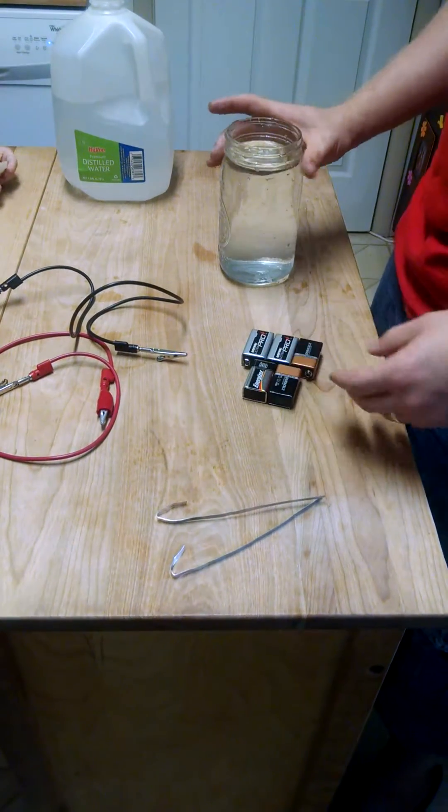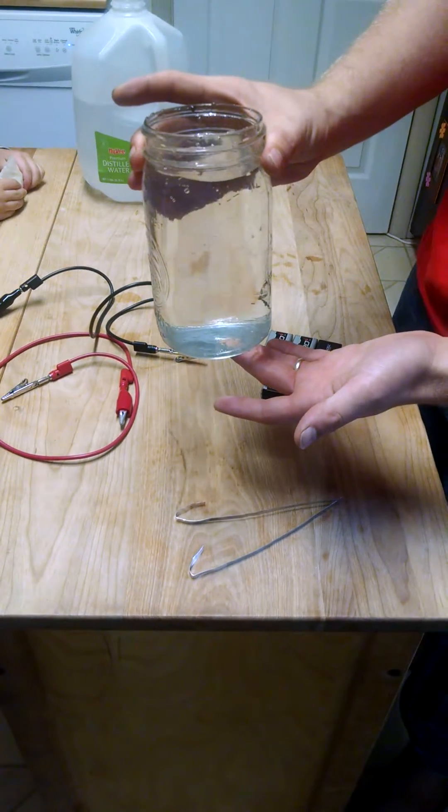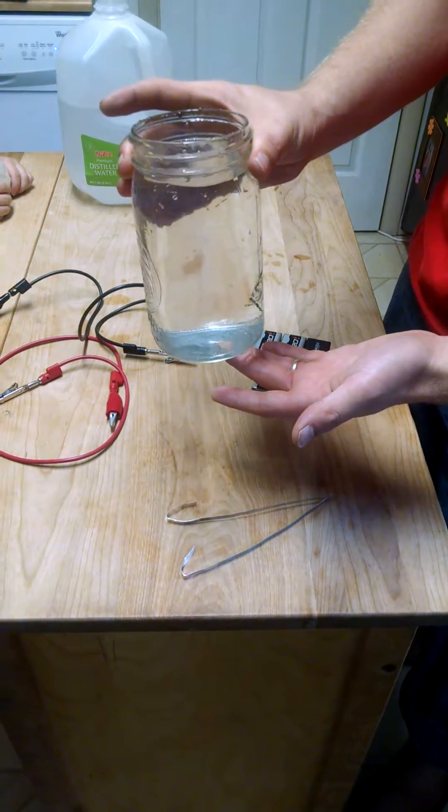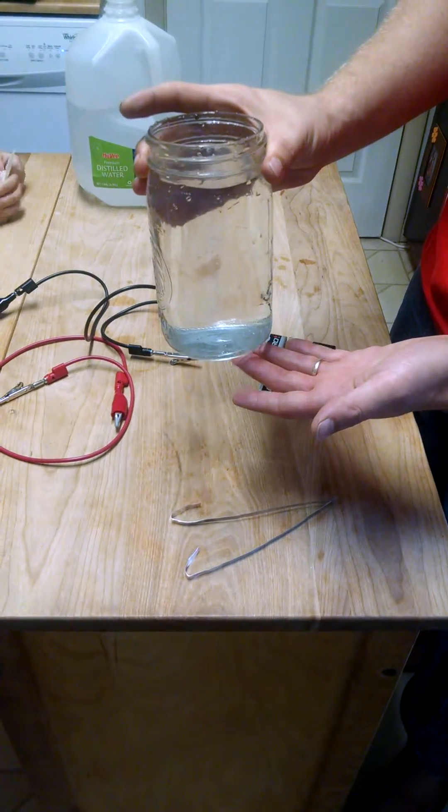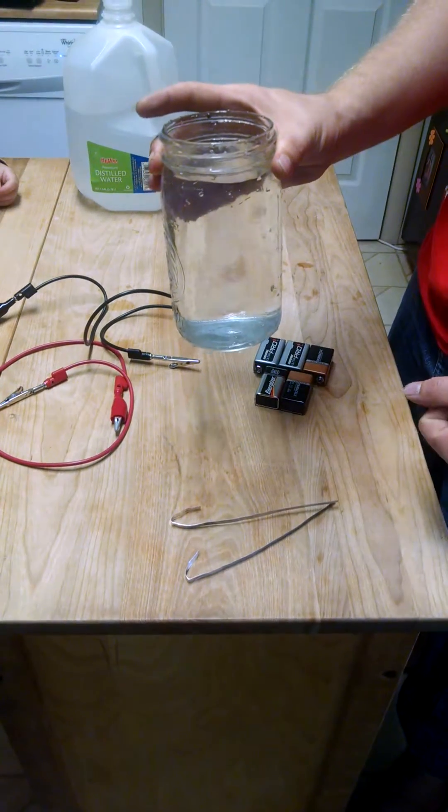So it's an electrolysis reaction. And so you need to fill a mason jar all the way up with your distilled water. You've got to rinse the jar with the distilled water first. Make sure it doesn't have any minerals left in it.